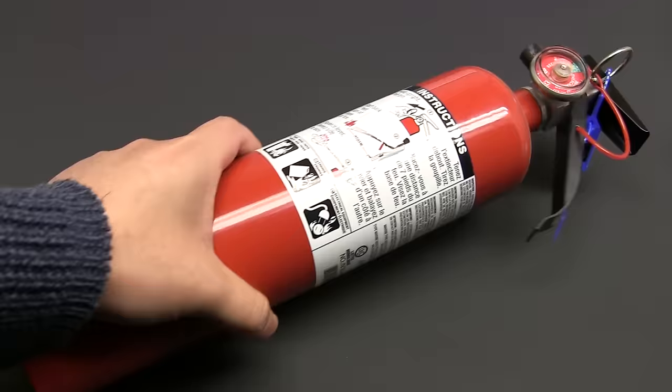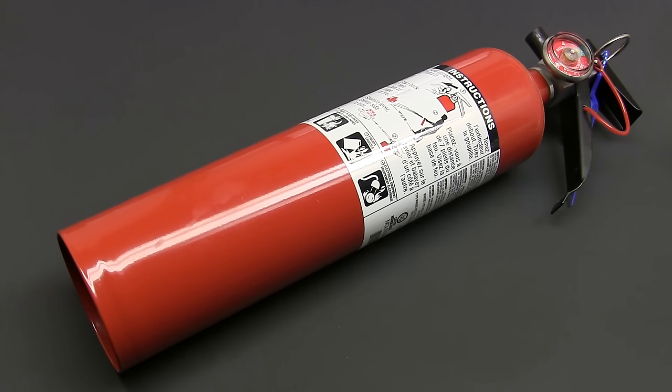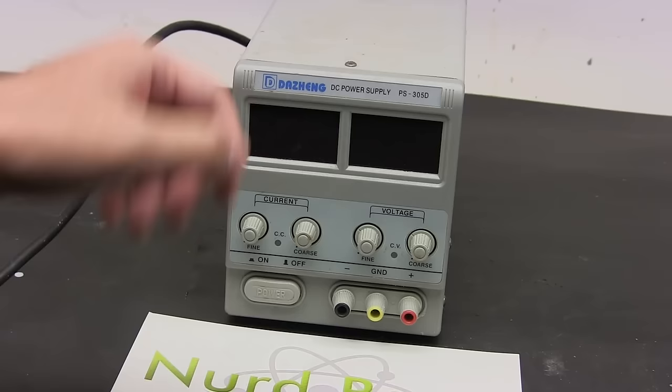Now of course a smoke detector is of limited use without a fire extinguisher. Hopefully you'll never need it but they are great for stopping a small fire from becoming a larger one. Select one that can deal with chemical fires and not just oil fires. And be sure to place them in an easy to access area. Check the pressure regularly to make sure they're not leaking and don't accidentally cover them up with other lab equipment as the years progress.